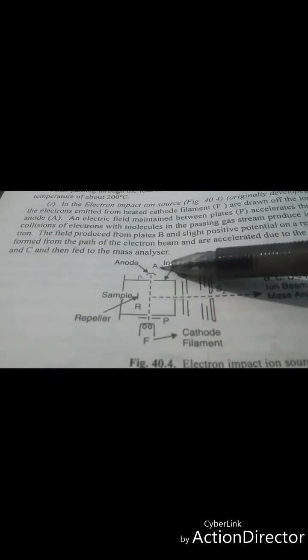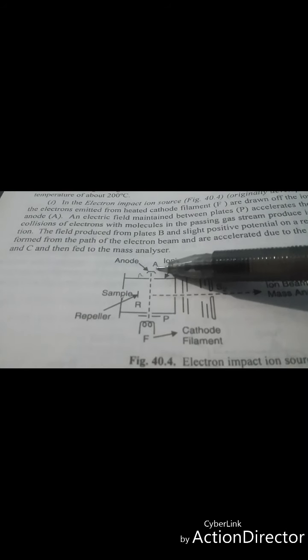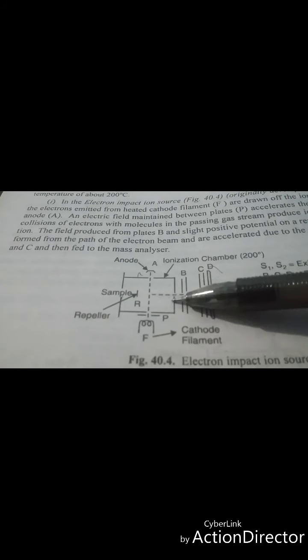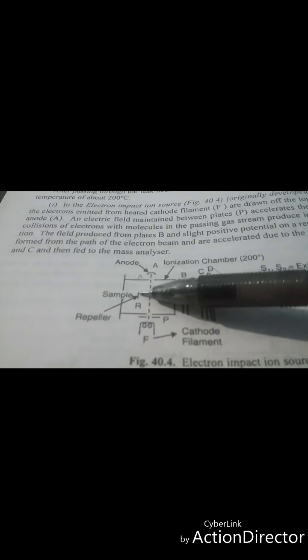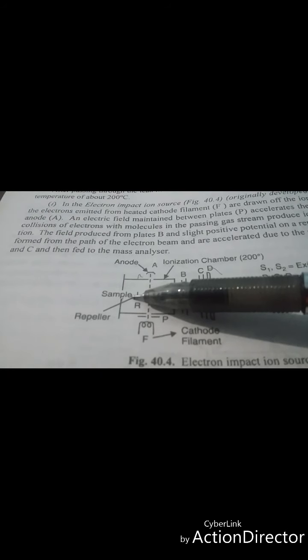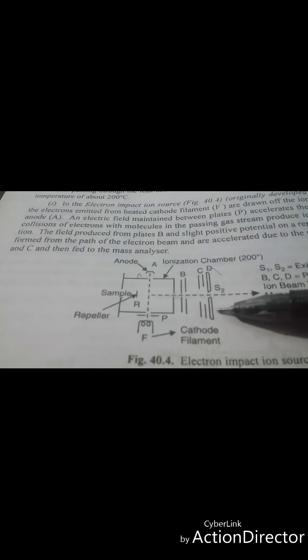You can see here the electrons are emitted from the cathode filament, and they are drawn off the ionization chamber to the anode, and an electric field is maintained between the plates to accelerate the electrons. Subsequently, the collision of electrons with the sample molecules in the passing gas stream will produce ionization and fragmentation.